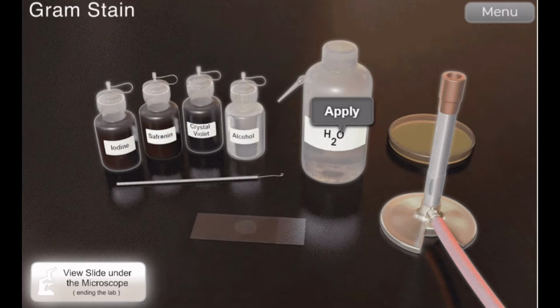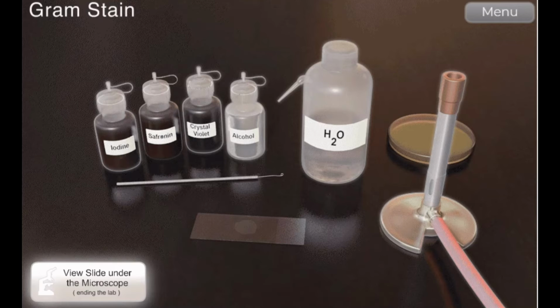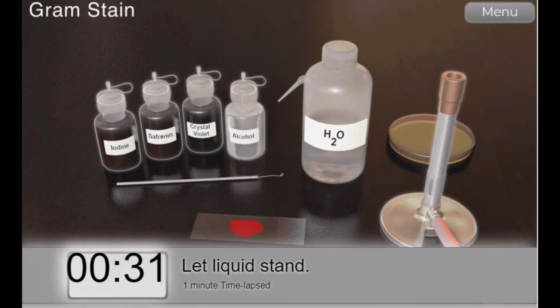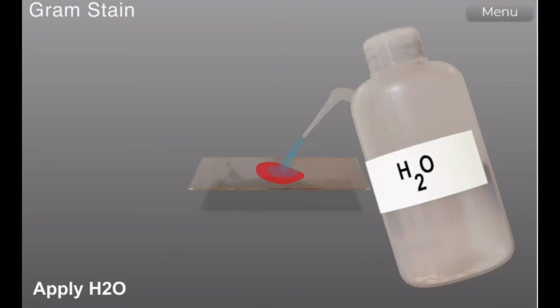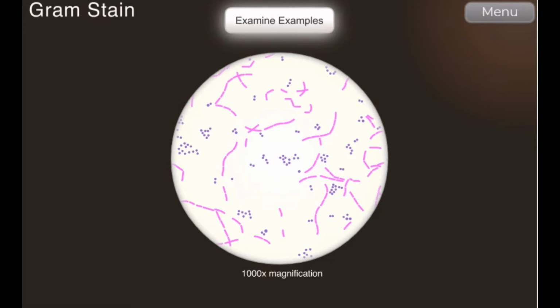And we will rinse the slide with H2O first. And we will flood the slide with safranin for 1 minute. And rinse with H2O. And we will view it under the microscope.